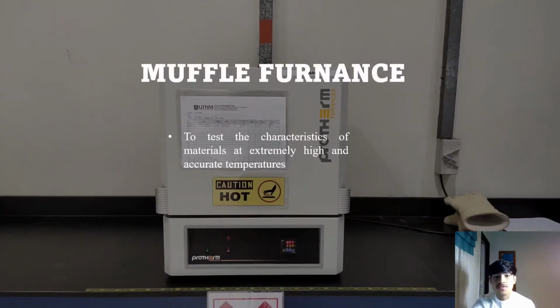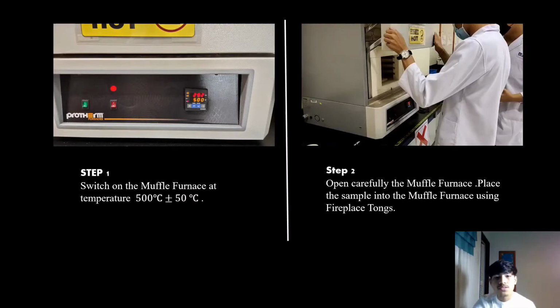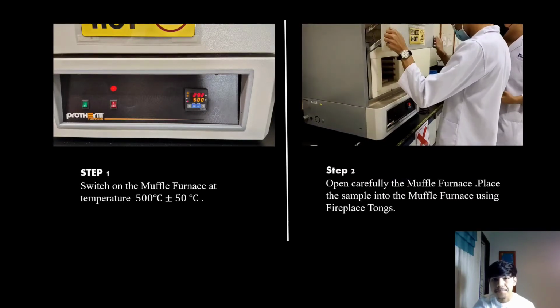First, the function of the muffle furnace is to test the characteristics of materials at extremely high and accurate temperatures. Step 1. Switch on the muffle furnace at a temperature of 500 degrees Celsius plus minus 50 degrees Celsius. Second step. Open the muffle furnace carefully. Then, place the sample into the muffle furnace using fireplace tongs.